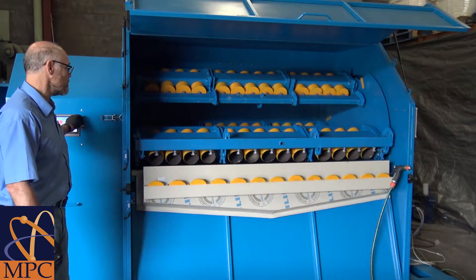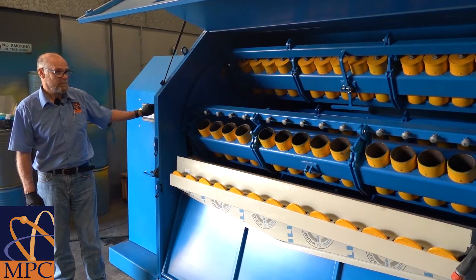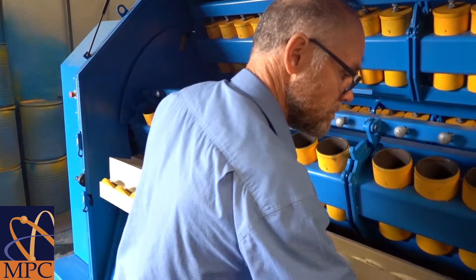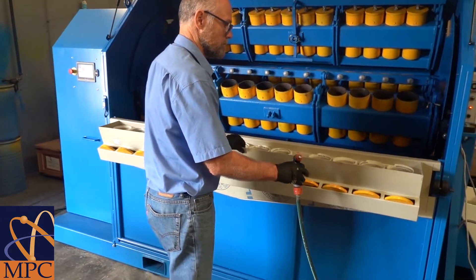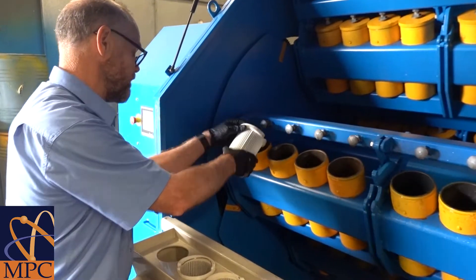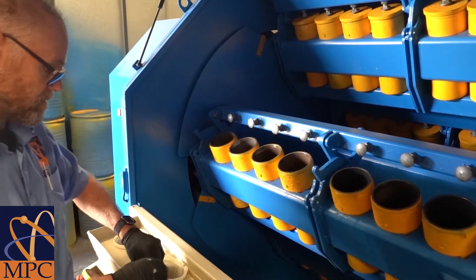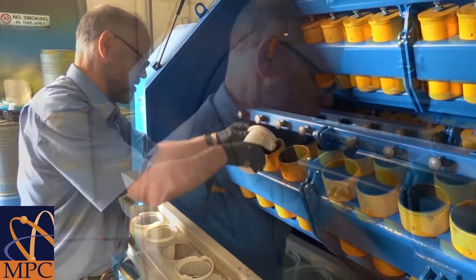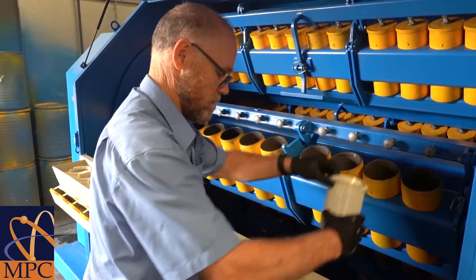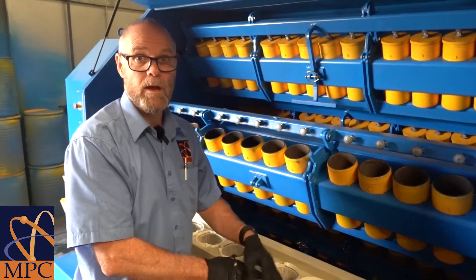The next step is to rotate the pots vertically again to replace the grinding media and get ready for the next samples. We pull the trough out, replace the grinding media in all of the pots, and we are now ready for the next samples.